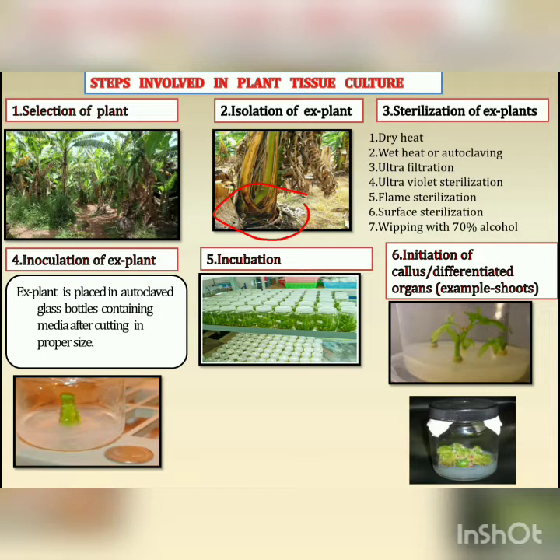Now this is the normal process which I have done in chemical sterilization. Different plants, different institutes, and different private firms have different procedures. Now fourth is inoculation of explant. What is inoculation of explant?